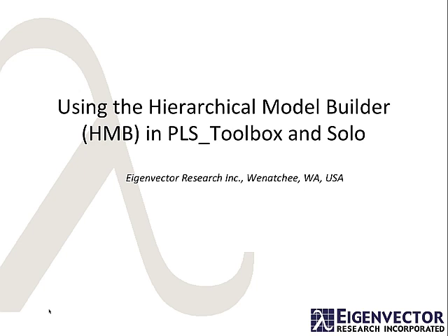Hi, this is Barry Wise, President of Eigenvector Research, and I'm going to show you how to use the Hierarchical Model Builder in PLS_Toolbox and Solo.